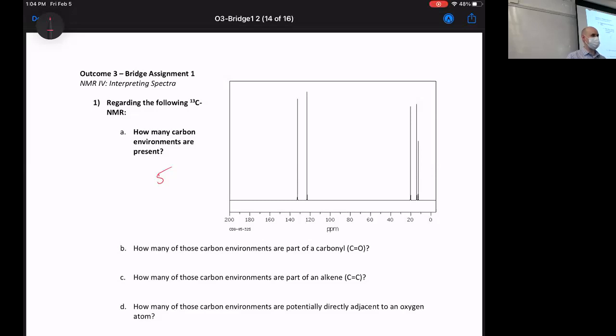So if we roll all of that in together, this is kind of our CH region right in here. It's the farthest to the right. I'm not, by the way, in case you try to sync this up with me saying that this is from -5 to 43, I'm just circling a general region. I'm not putting specific numbers on there right now. I'm just giving you a rough approximation.